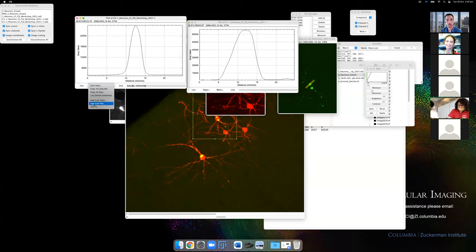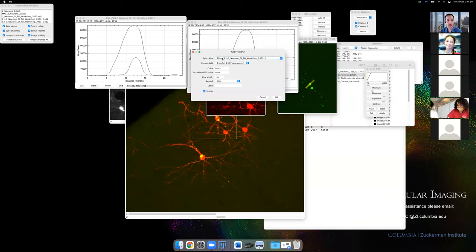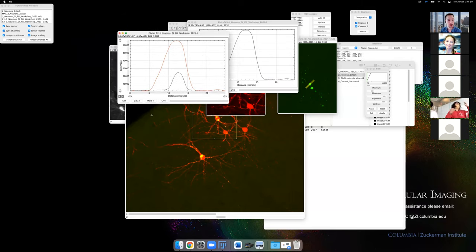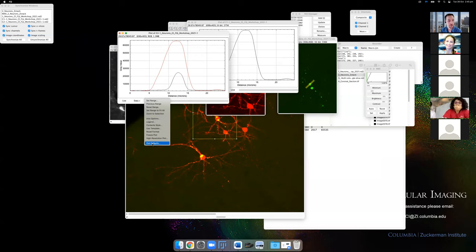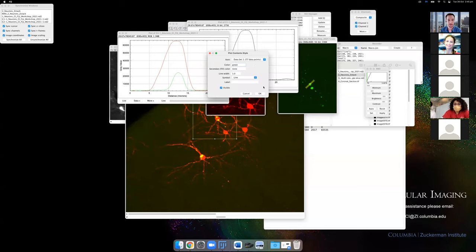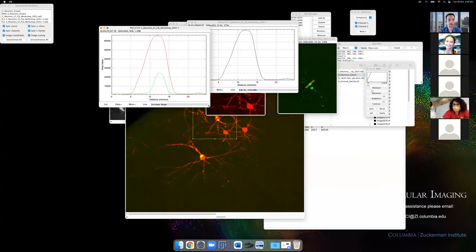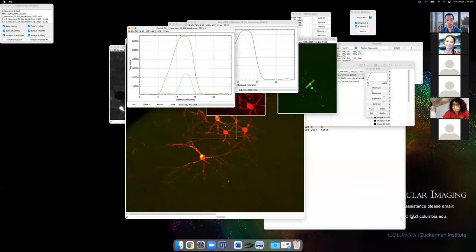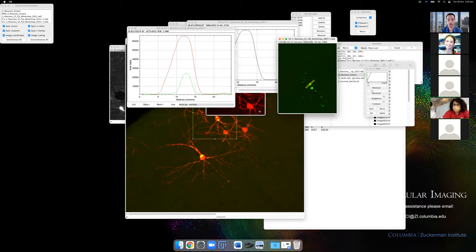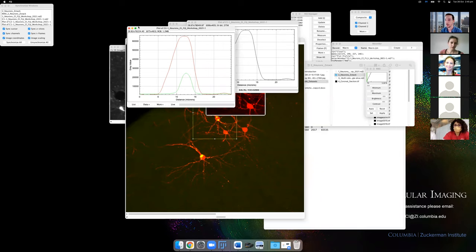You can combine plots — use 'Add from Plot' to overlay multiple profiles in the same graph and assign different colors to each. This lets you create a quick, clear figure showing, for example, the red cell channel and the green protein channel in the same plot. If you click 'List,' you can export the data to Excel for a nicer figure. This is a very easy way to show something like membrane localization.